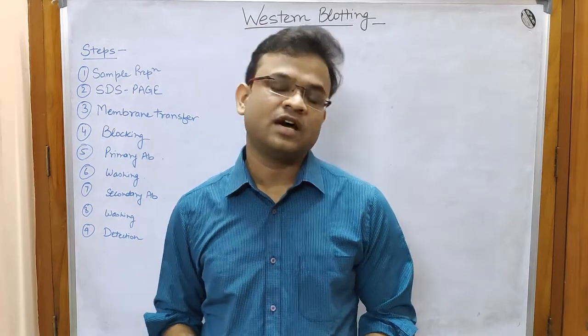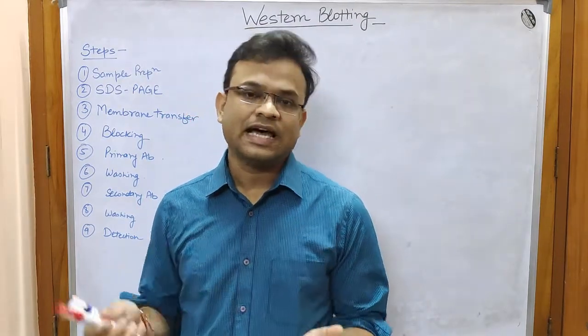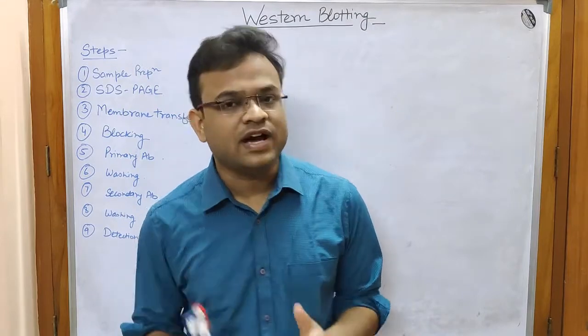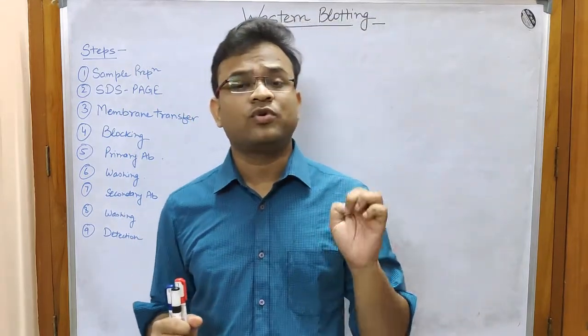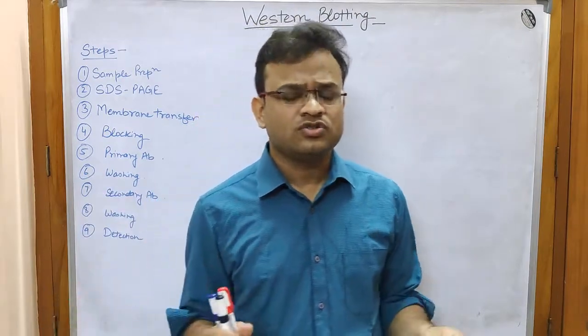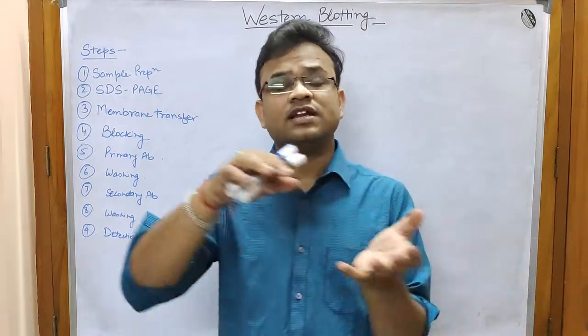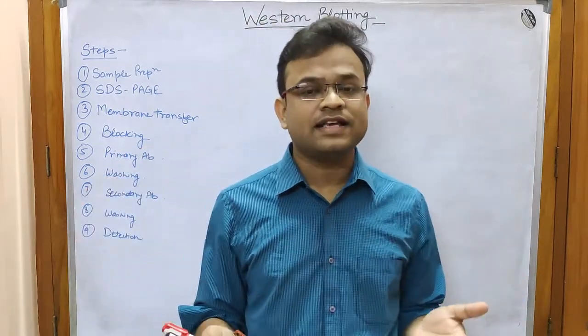The topic that we would deal with today is Western blotting. This is a very important technique in order to identify whether a particular protein is present in the sample that you are analyzing or not.